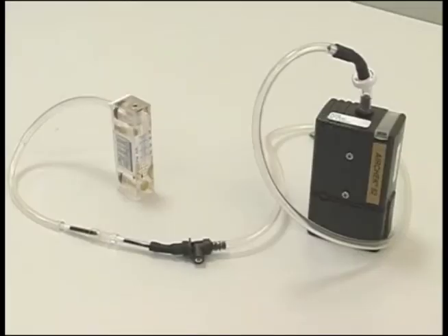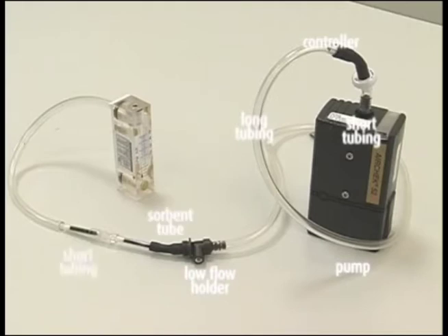Set up the pumps with the correct media in line with the field rotometer as shown. The order of the components for calibration is: pump, short length of tubing, constant pressure controller, long length of tubing, adjustable low flow holder, sorbent tube, short tubing, sorbent tube, and rotometer.